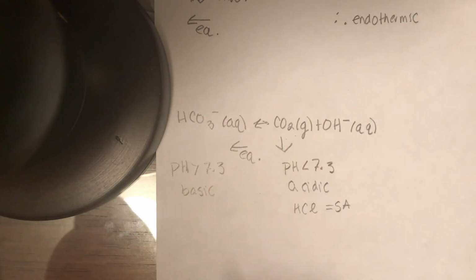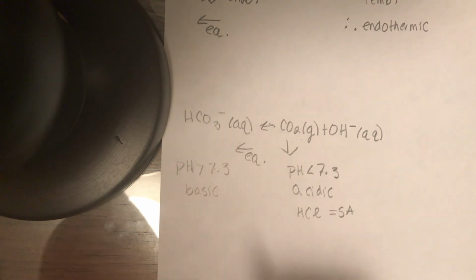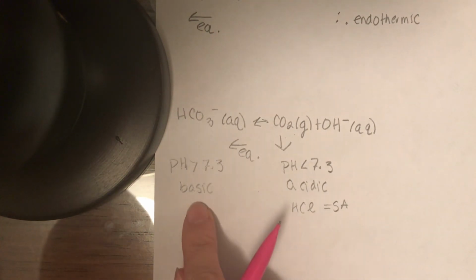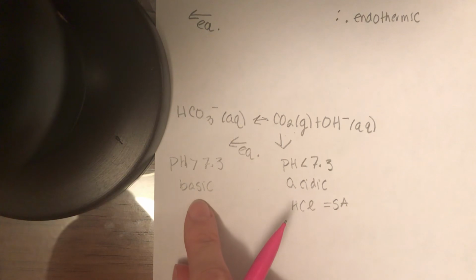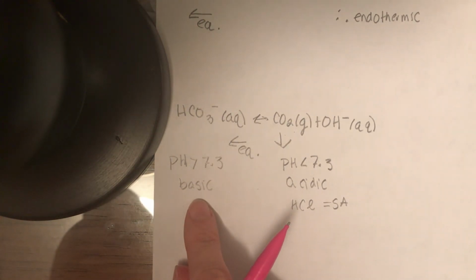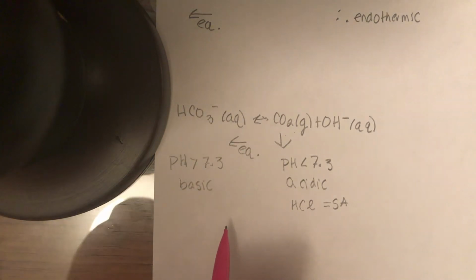When we performed this experiment, we witnessed the yellow-green solution bubble a little bit as the gas was leaving, and the color then turned to a light blue, which indicates that the solution is back to the more basic solution, but it still has some acidity left over because the solution was not 100% the same shade as before the HCl was added. So this supports a shift to the right in equilibrium because we saw a lighter shade of blue as the final product as CO2 was taken out of the solution.